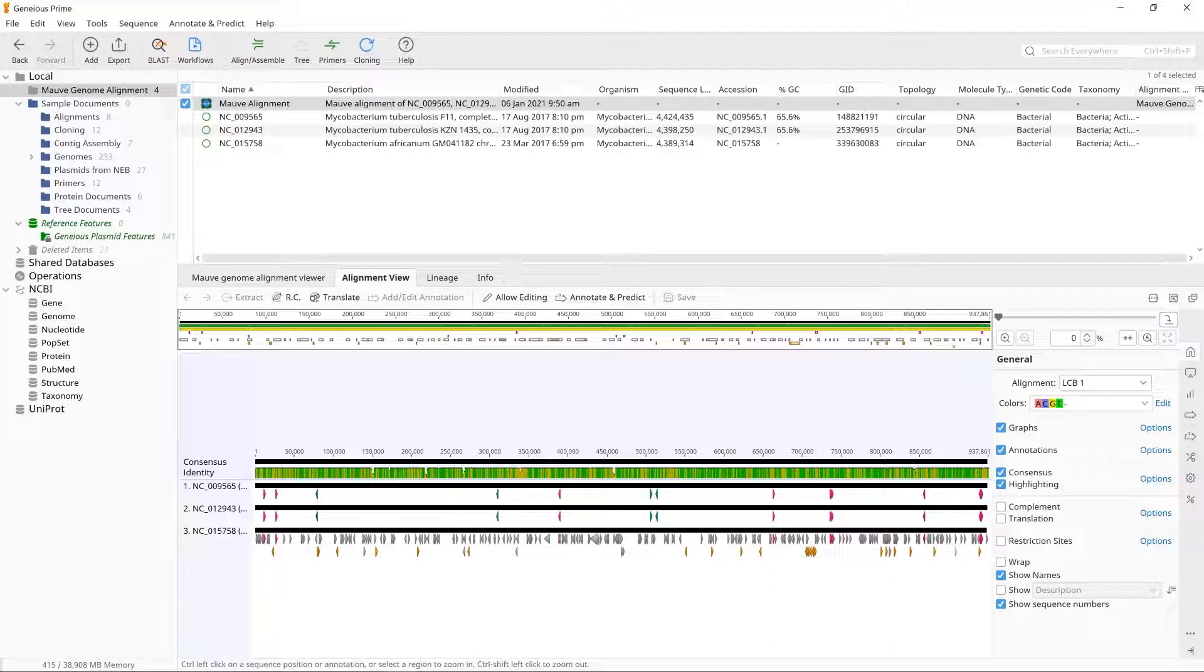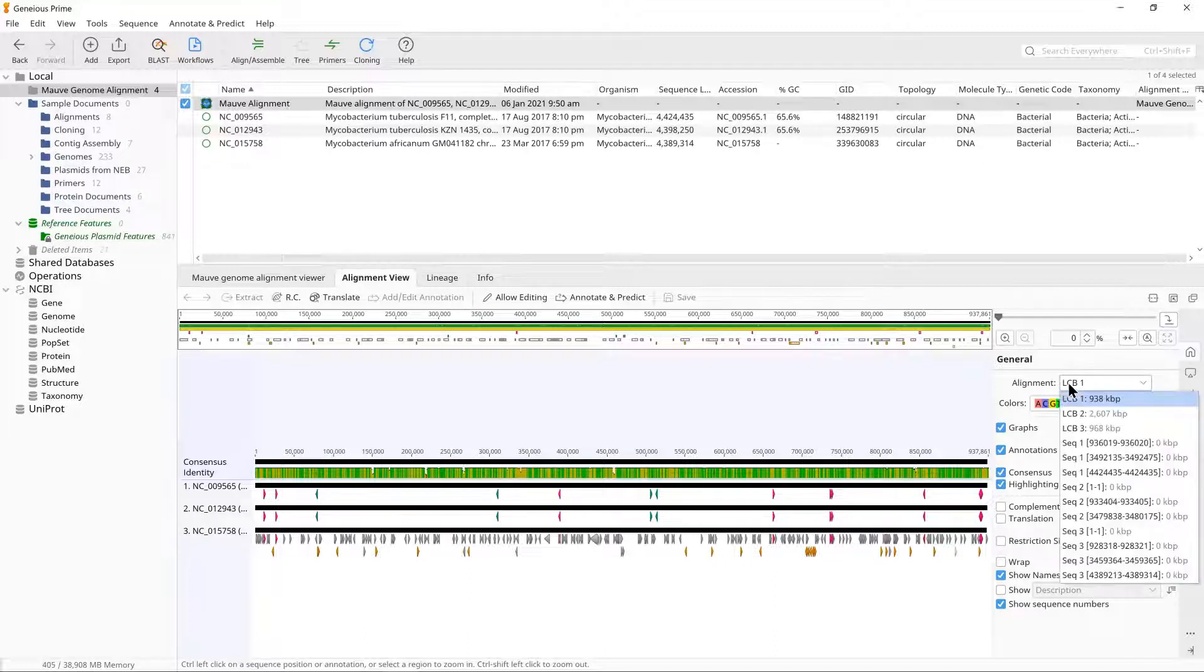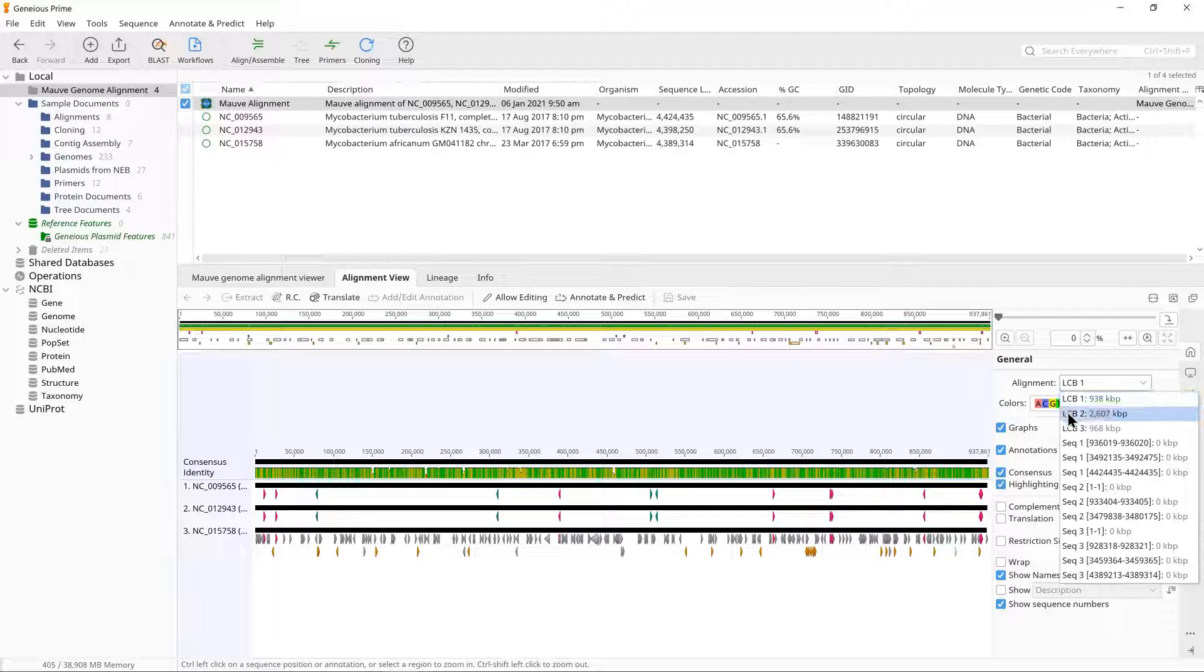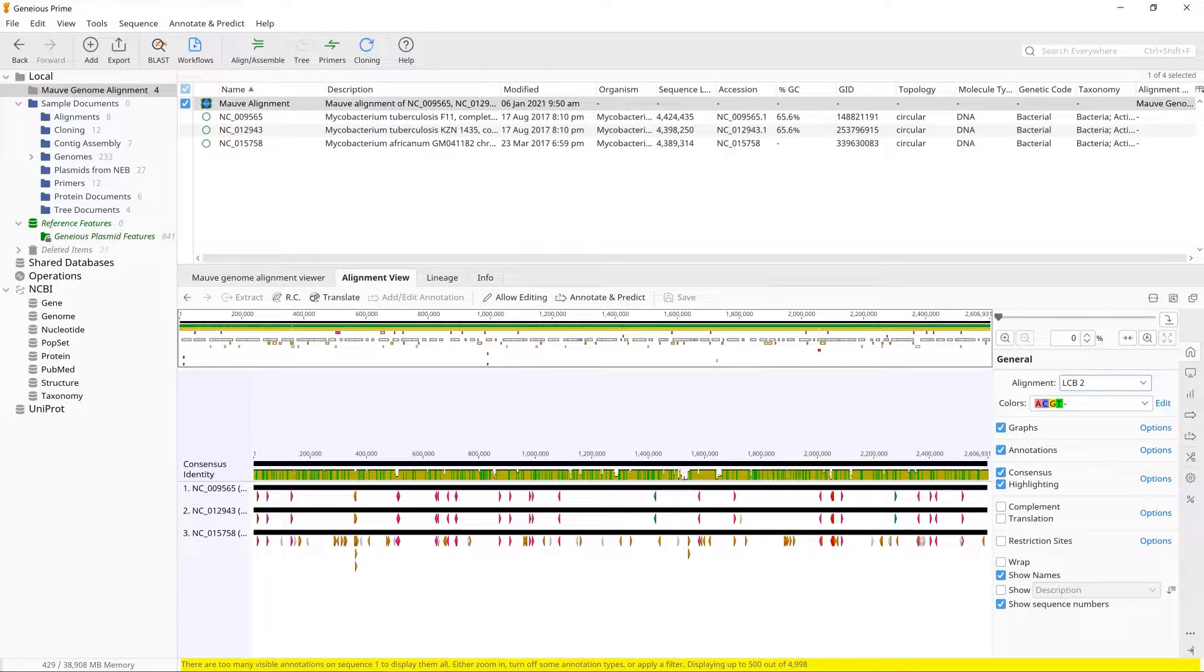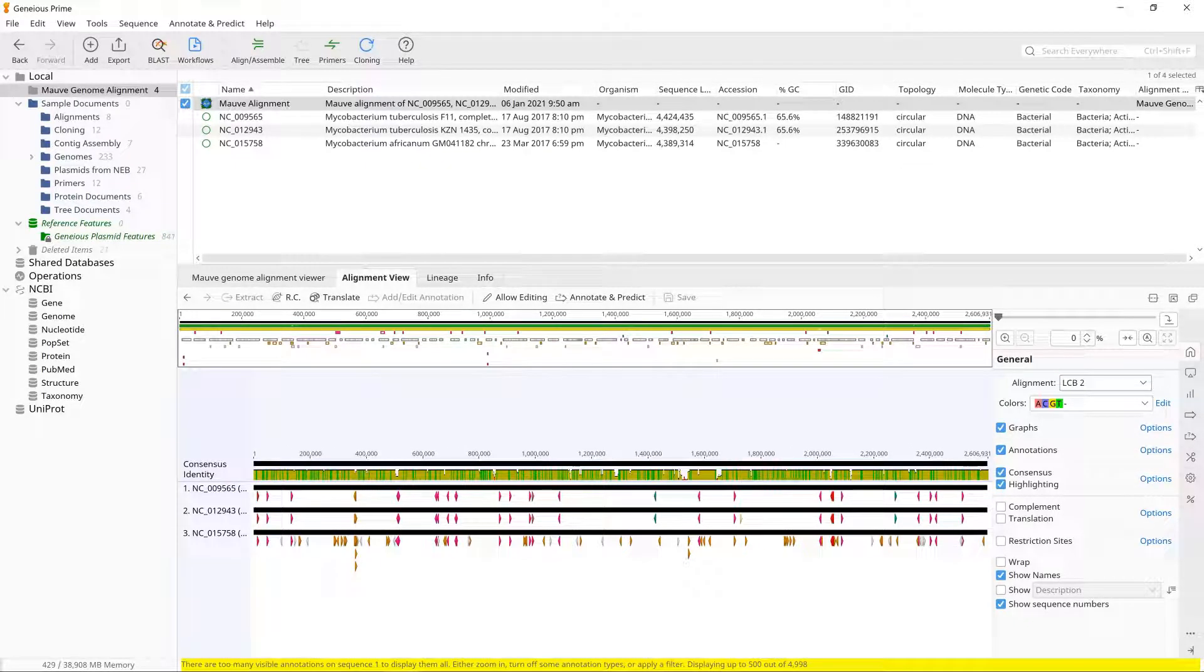To choose which LCB to display, use the drop-down alignment chooser in the display tab next to the viewer. Try changing the alignment view to LCB2. This is the middle block where NC_012943 was inverted.